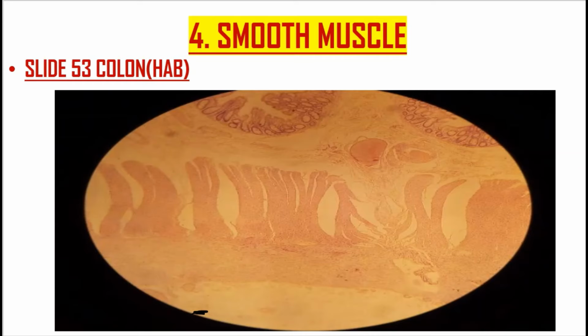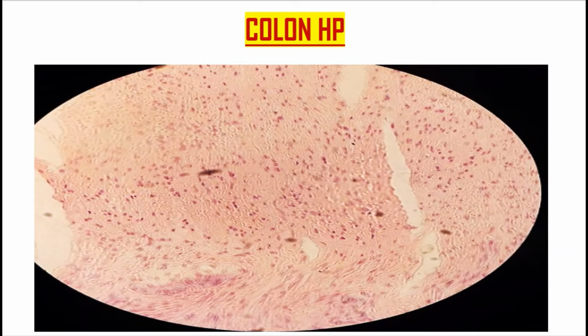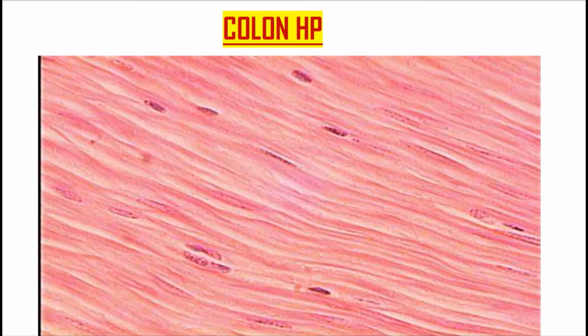So this is at low power. Here you just observe. Okay, if this is not clear, you just observe. Just observe this slide. Don't draw it. And then at high power, they look like this. But here the fusiform shape is not appreciated, so I added this slide here.